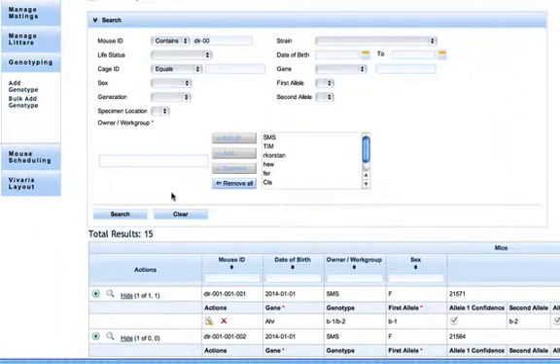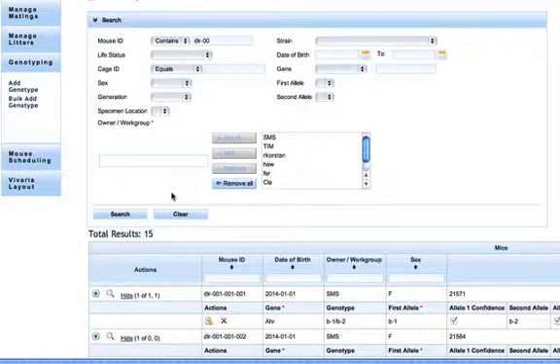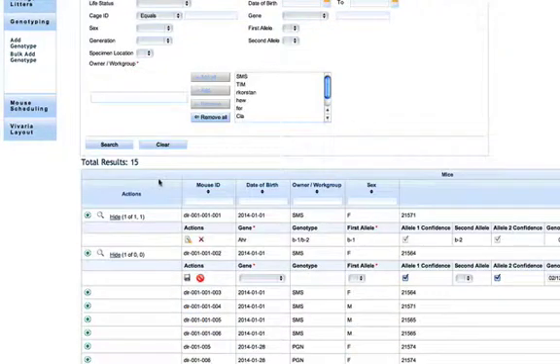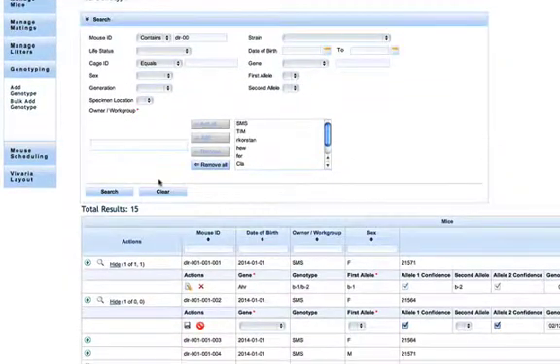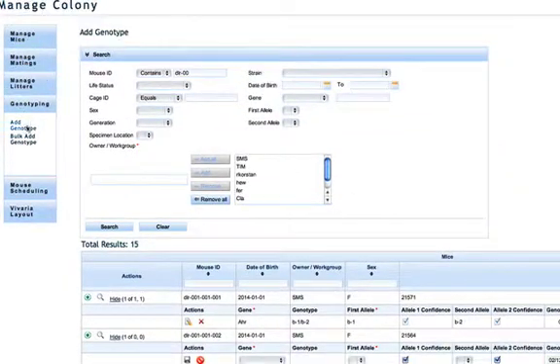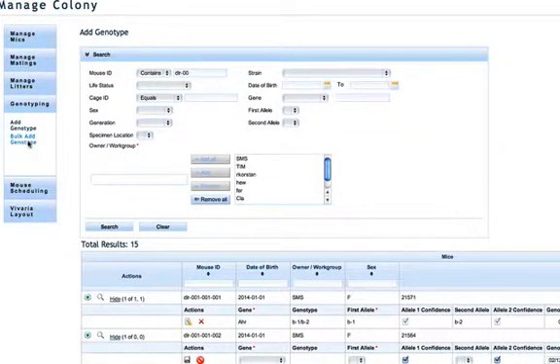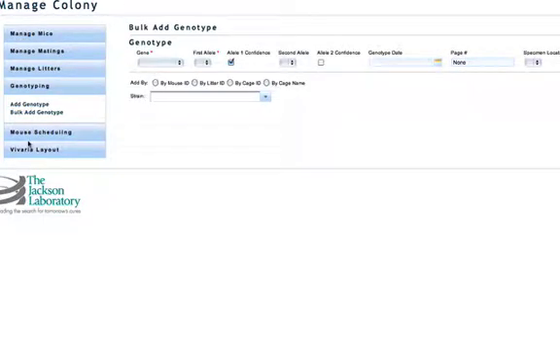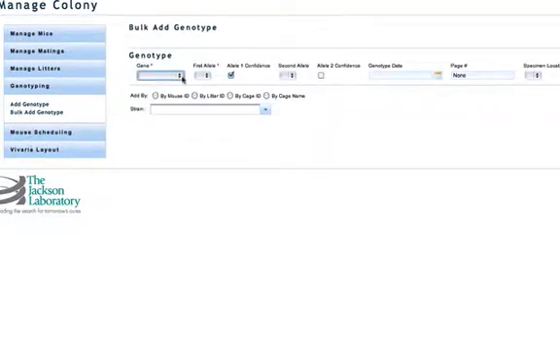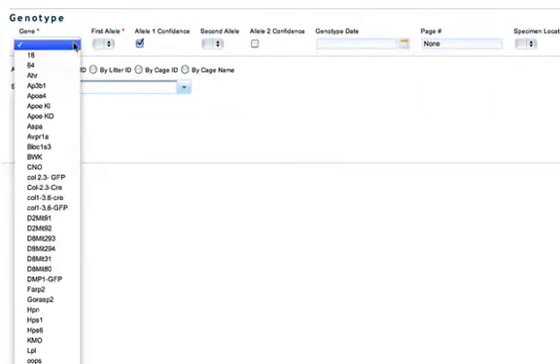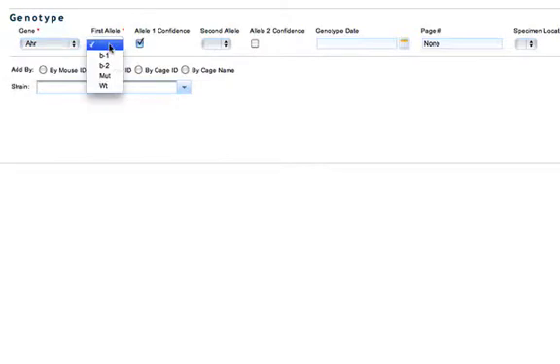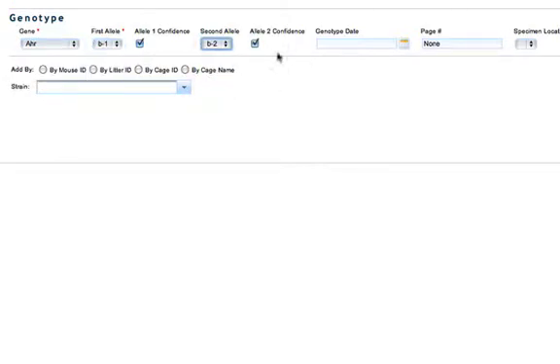Now I'll show you how to bulk add a genotype. Click on bulk add genotype in the left navigation, select a gene that you'd like to add to multiple mice, and a first allele and second allele.